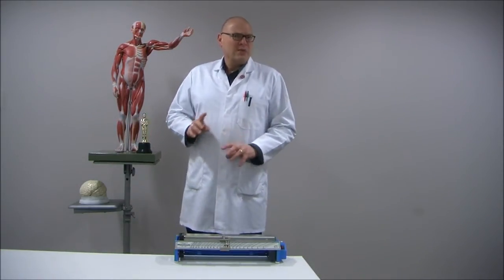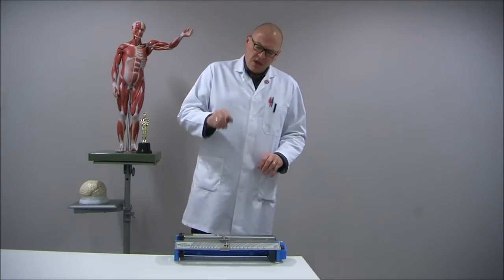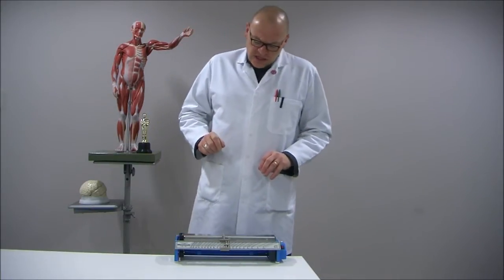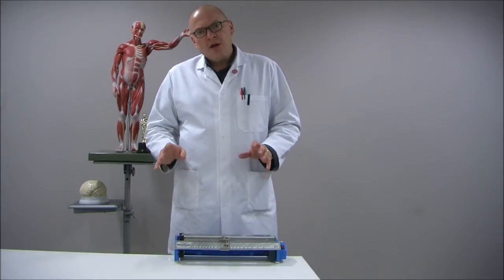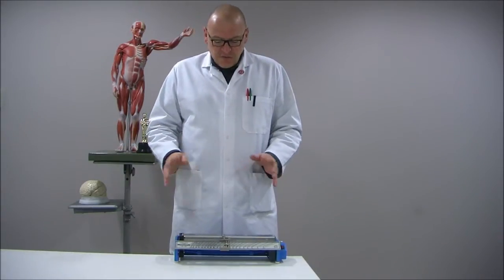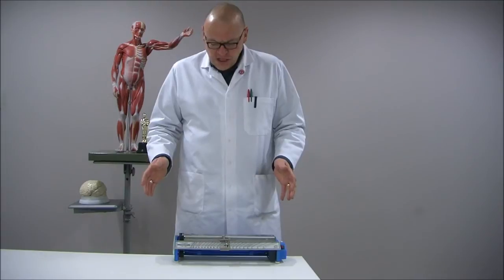You know, I've a wonderful product to show you today. This is the Koffler Hot Bench. It was designed in 1936 by Ludwig Koffler and it's remained pretty much unchanged down through the decades.